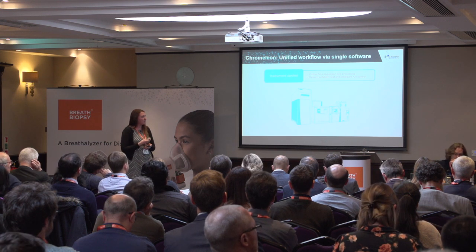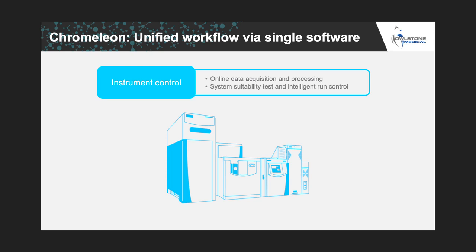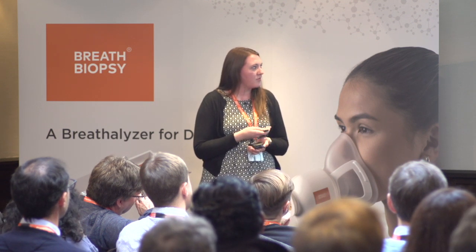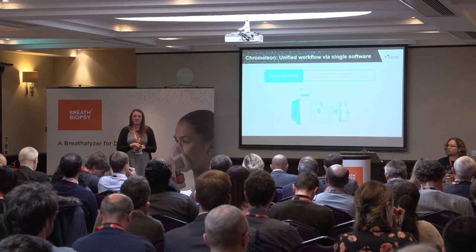To give some examples, instrument control. The ability to control the Markes TD, the TD-GC, and the TD-Orbitrap in the same software in a single sequence can't be understated for the simplicity it provides our analysts. It also provides system suitability checks at point of acquisition.